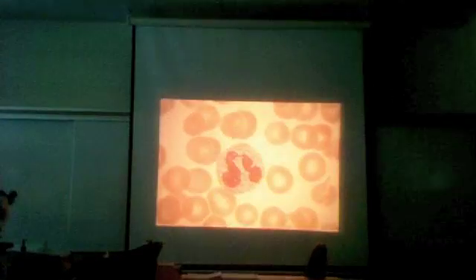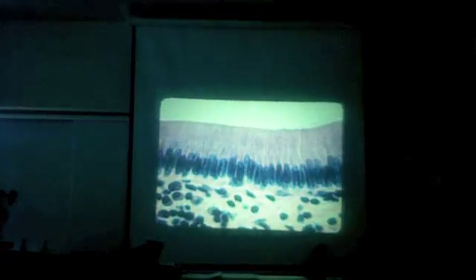What are those? And what do they do? Okay. All those little purple things. Lymphocytes. Oh, we've been there, done that. And so all these little purple things, lymphocytes, here they are in action.